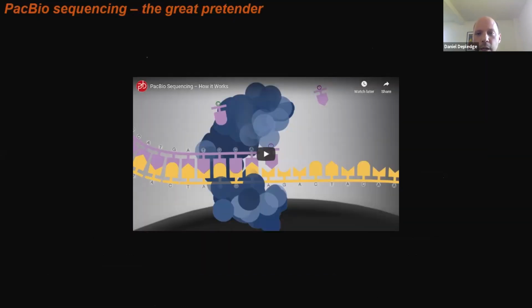So we talked a bit about the workhorse in terms of Illumina sequencing. This is one that everyone does. I want to show you a quick video about how PacBio sequencing works. PacBio sequencing has very much got its place. I'm not sure as a technology how much longer it's going to last in comparison to Nanopore, but there are certainly some places that still very much swear by it.